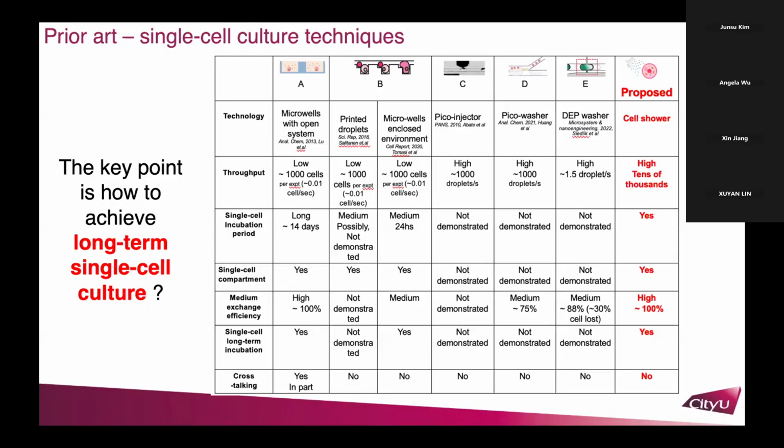However, one of the biggest obstacles for current microfluidic-based platforms is how to achieve long-term single-cell culture with very high throughput. Therefore, we proposed our device to try to achieve this purpose.